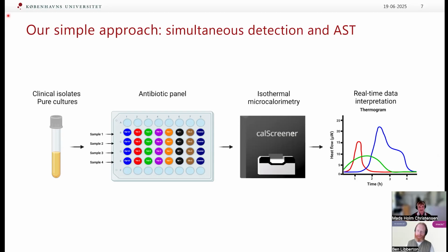Cool. Yeah. Some more questions here. So, do you only detect heat when the cells are in exponential phase? And the follow-up question there is, if cells are growing kind of slow, does the system still perform? And then do you have to make any adjustment to the cutoffs?